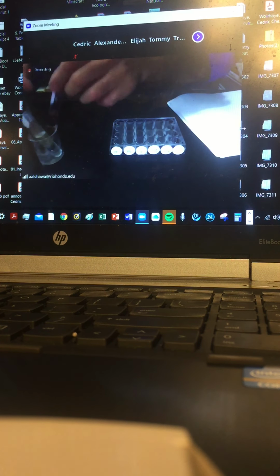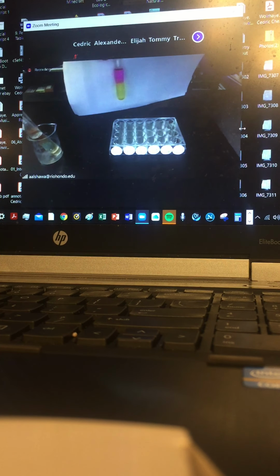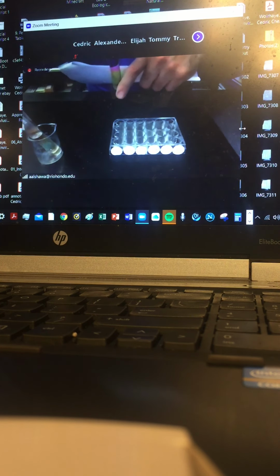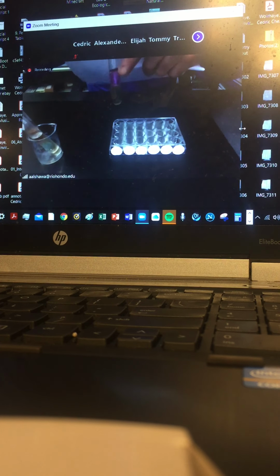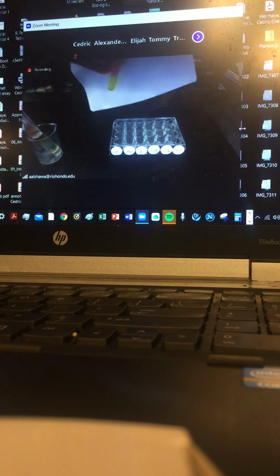The last of the halogens is iodine. The color of the iodine is split between the aqueous solution and the organic solution, hexane. So the iodine has a very unique color.